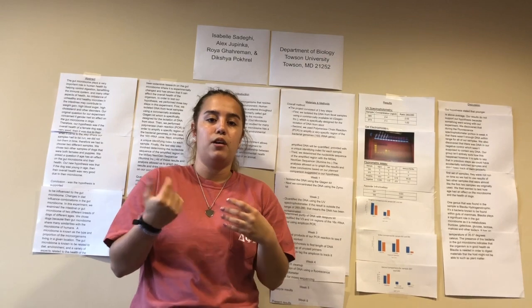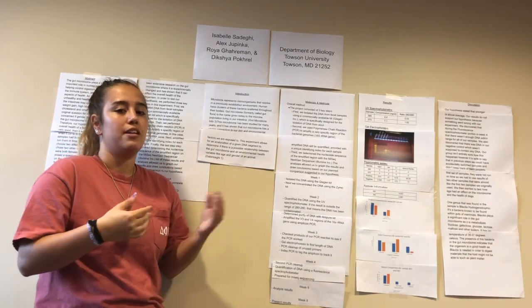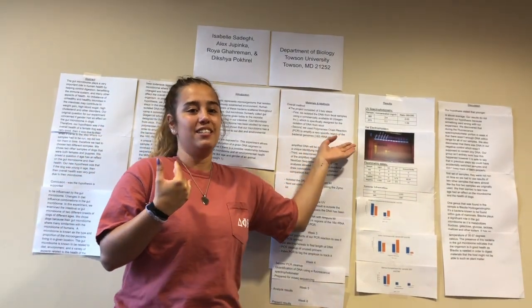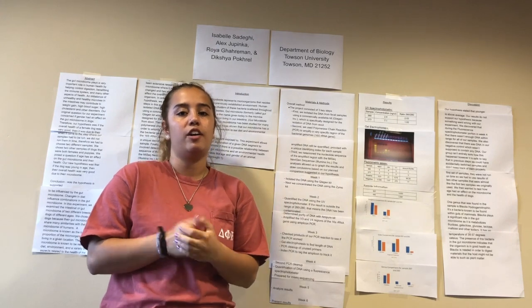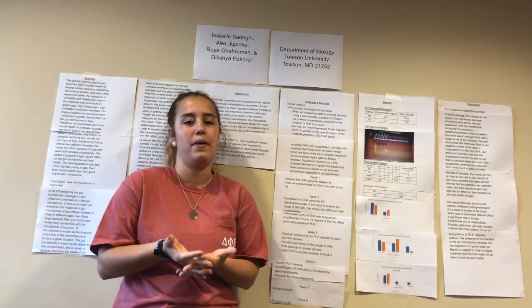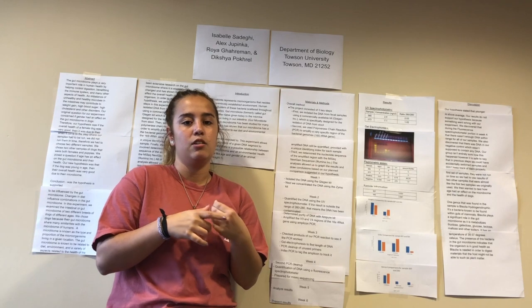So discussing our amplicon PCR results, the amplicon PCR results were unsuccessful in the gel electrophoresis because as we pipetted our samples into the wells, some of the samples leaked into the neighboring wells and thus contaminated our results as seen. Our negative control ended up having DNA in the sample because of this, and there were no bands present on our first 3 samples of DNA, and the concentration was too low to detect anything.